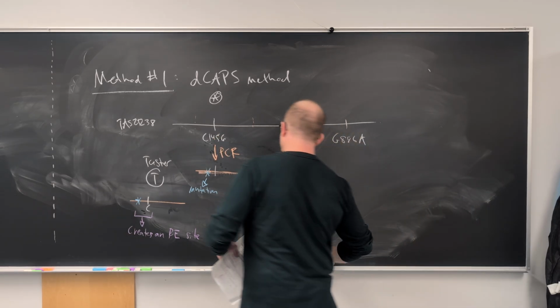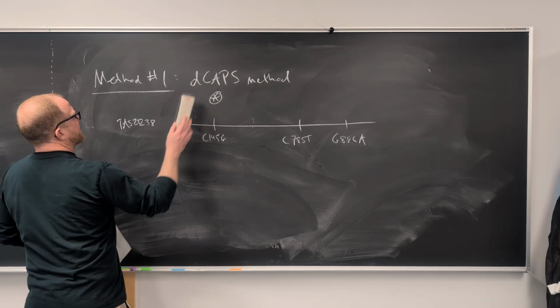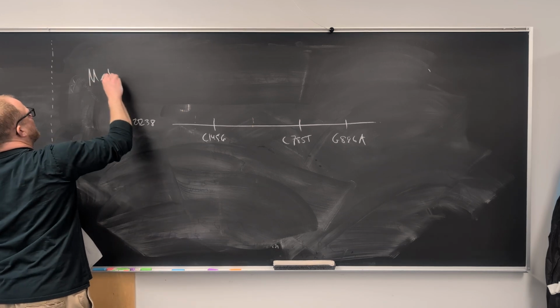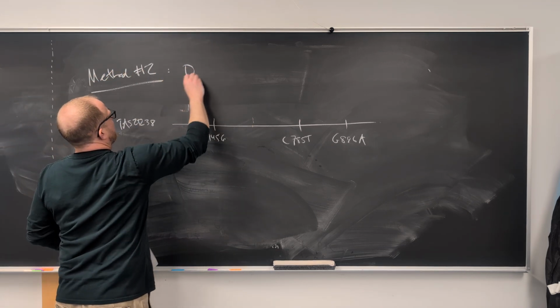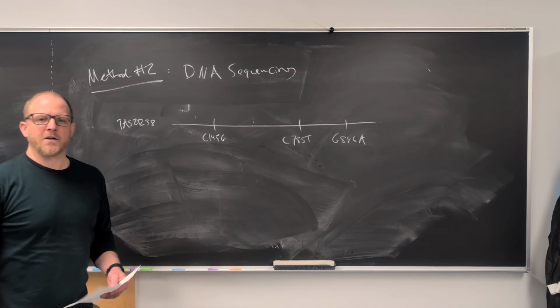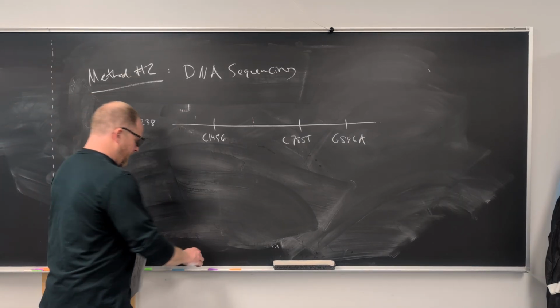We're going to use another method, and this one I'm kind of excited about. The second method we're going to use is DNA sequencing. We've been talking a lot about this in lecture, and so we actually have a chance to do some Sanger sequencing in lab.